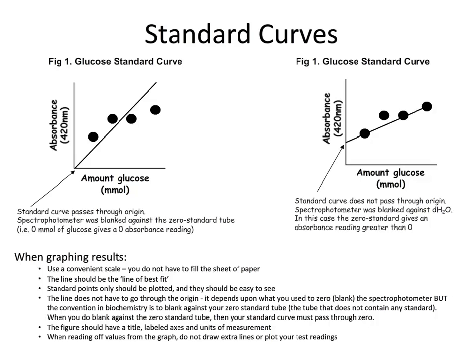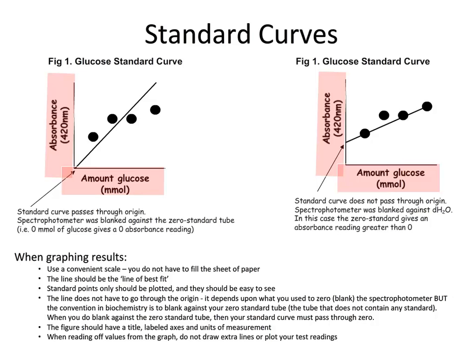When you graph your results, it is ideal to use a convenient scale so you do not have to fill the whole sheet of paper. For a standard curve, you should always draw a line of best fit — do not simply join the dots. Standard points only should be plotted and they should be easy to see. The line does not have to go through the origin; it depends on what you use to zero the spectrophotometer. The convention in biochemistry is to blank against your zero standard tube — the tube that does not contain any standard. When you do blank against the zero standard tube, then your standard curve must pass through the origin. All figures should have a title, all axes should be labelled, and the units of measurement provided. When reading off values from the graph, there is no need to draw extra lines or plot your test readings — it just makes things messy.